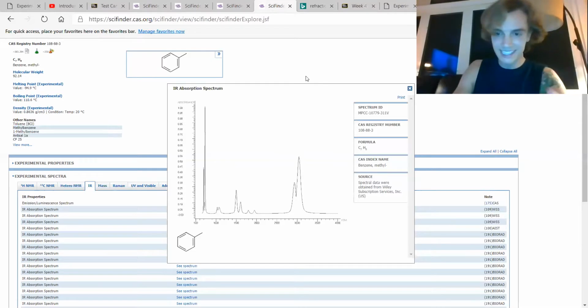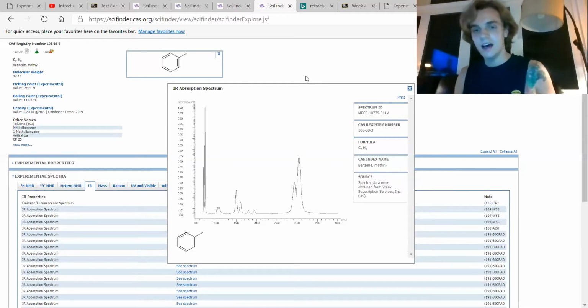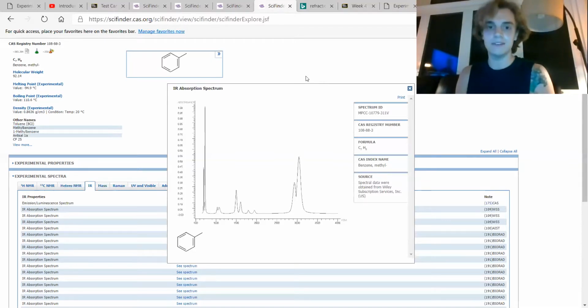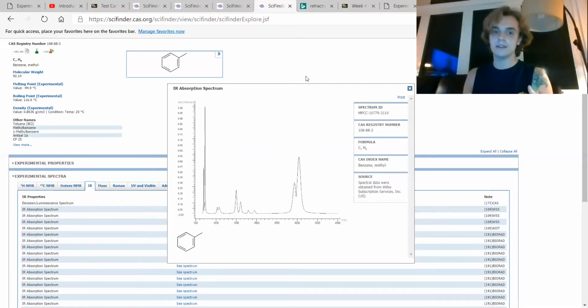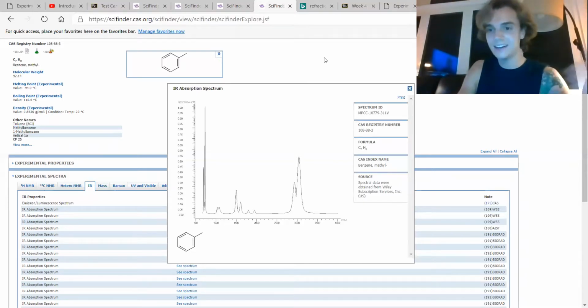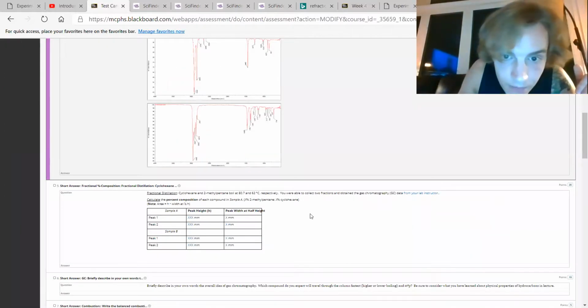And now using just these analytical depictions of what your spectra should look like based upon these compounds, it should make it extraordinarily easier to elaborate which compounds you are analyzing when you observe spectra in our lab. Even though these will not be exact, they are, again, just reiterations based upon several hundreds of thousands of algorithms, but they are not exact. I will reiterate that. Moving on to the next question, so I can help you guys out.